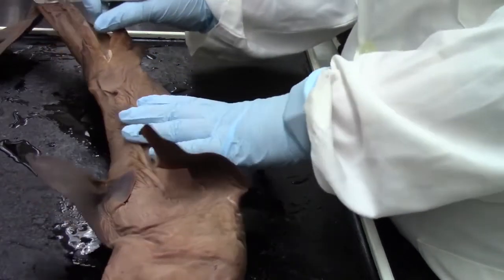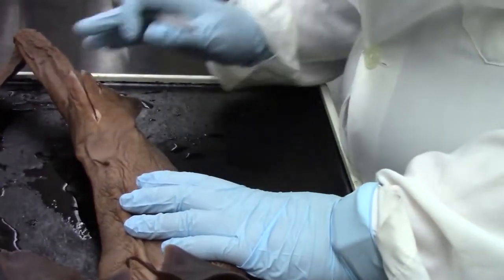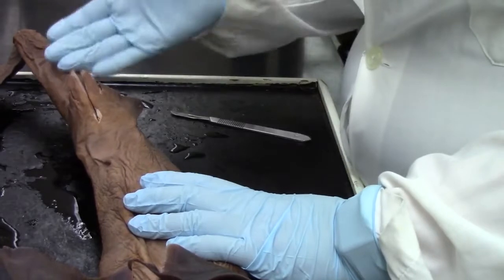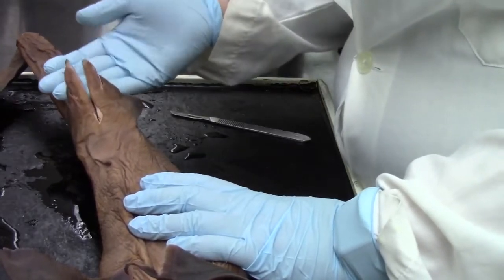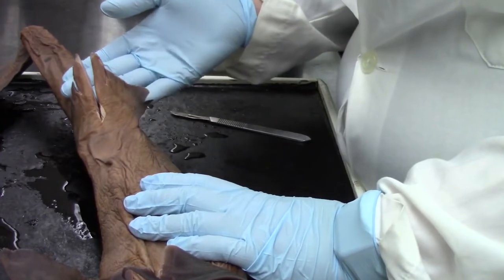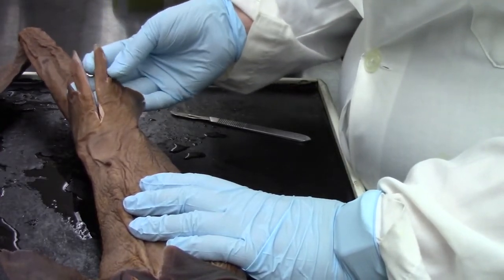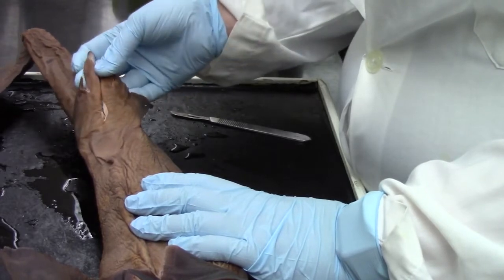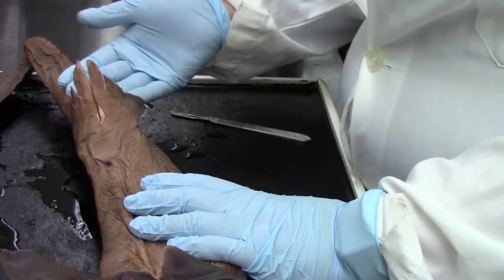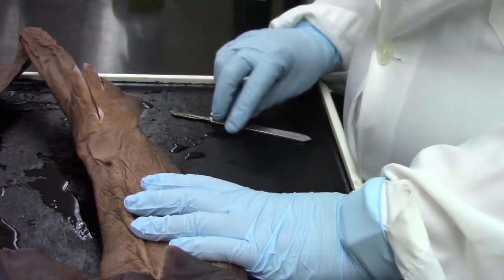Before I do, I also want to point out, here's just our closer view of the claspers. So you can see that these pelvic fins are modified in such a way so that they have these kind of firm projections coming off of those, and that will actually be used to aid in internal fertilization.